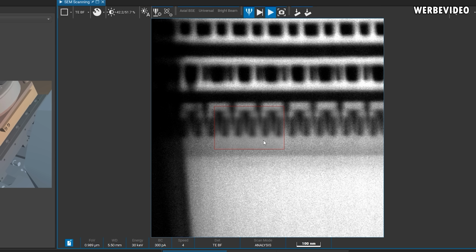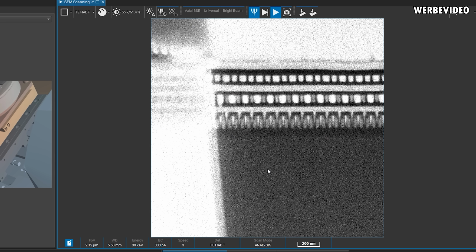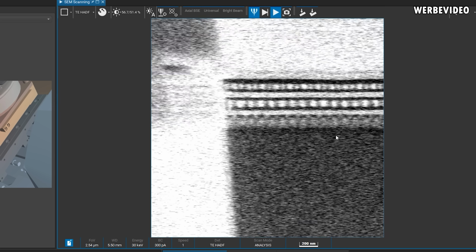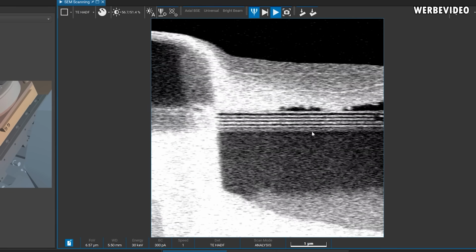On the first look, it's probably quite difficult to figure out what exactly we're looking at and which part is a transistor. Our goal was to cut through the level 1 cache of the CPU, because the level 1 cache, for comparison, makes it a little bit better to compare the CPUs. If you cut somewhere through the logic, you'd certainly have differences between Intel and AMD CPUs, and comparing CPUs directly probably makes it easier just to cut through the cache, which is fairly the same on the CPUs.